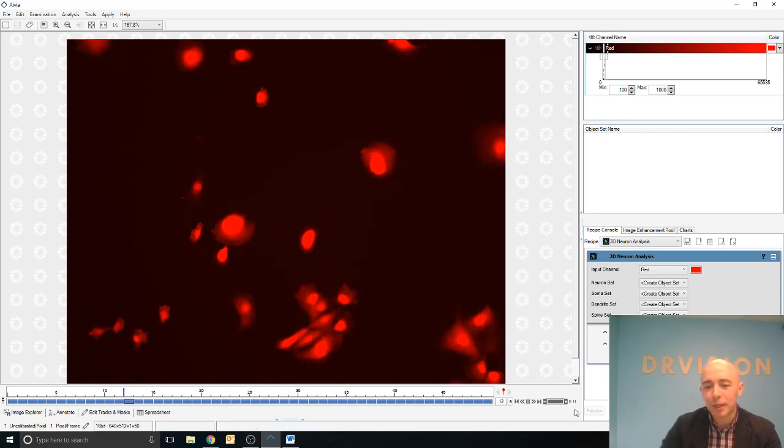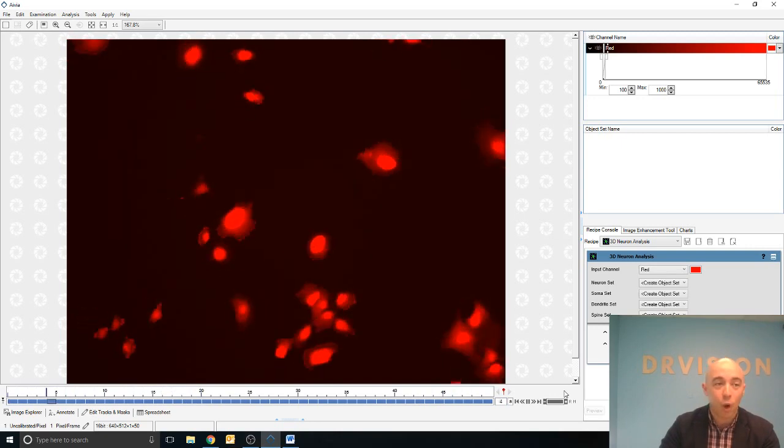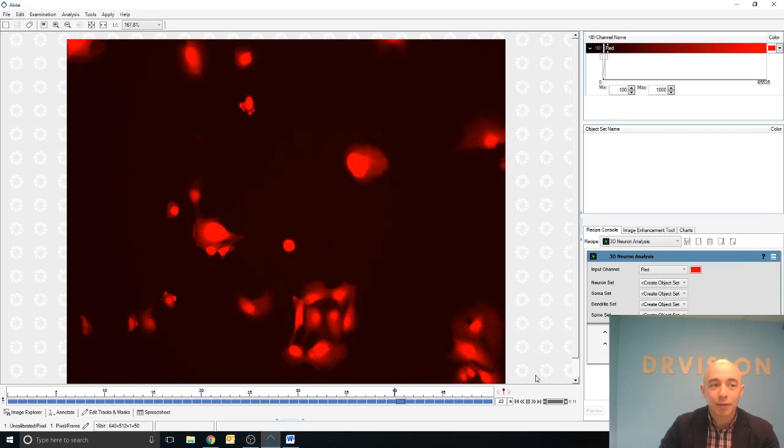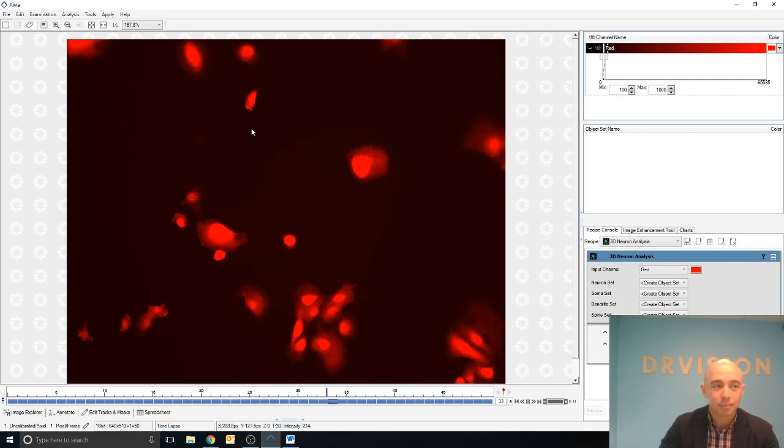The playback speed we have set here is not necessarily the real-time speed of the cells in this image. Just like with spatial dimensions, x, y, even z, when dealing with time-lapse images, there is a time resolution that describes the elapsed time between consecutive frames. Here we have left it uncalibrated and artificially set the playback speed significantly higher than real life, as these cells tend to move very, very slowly.